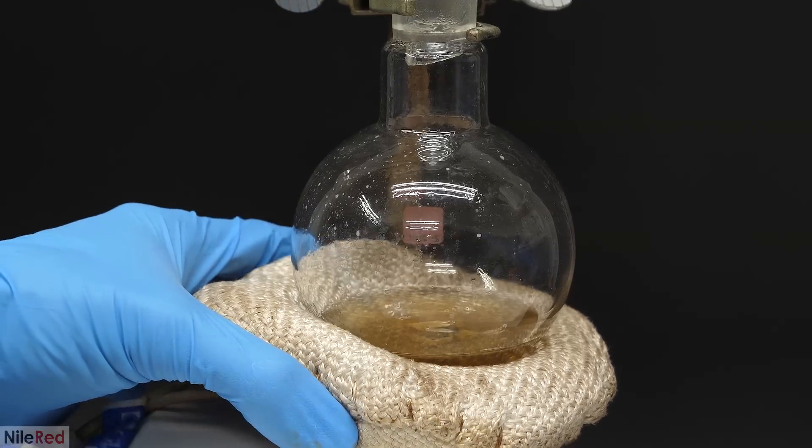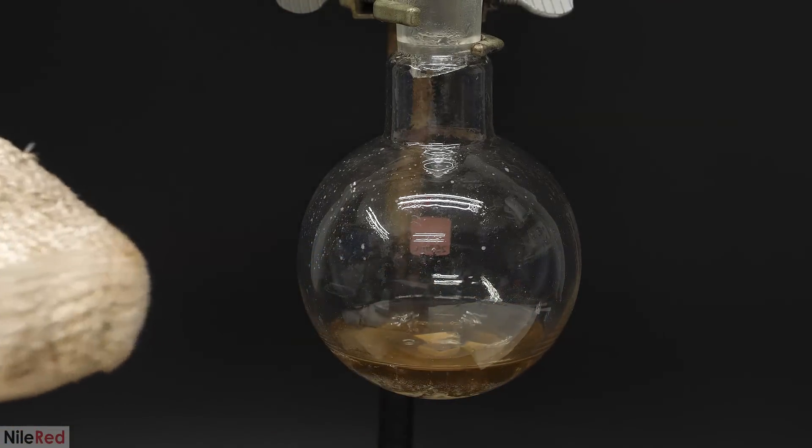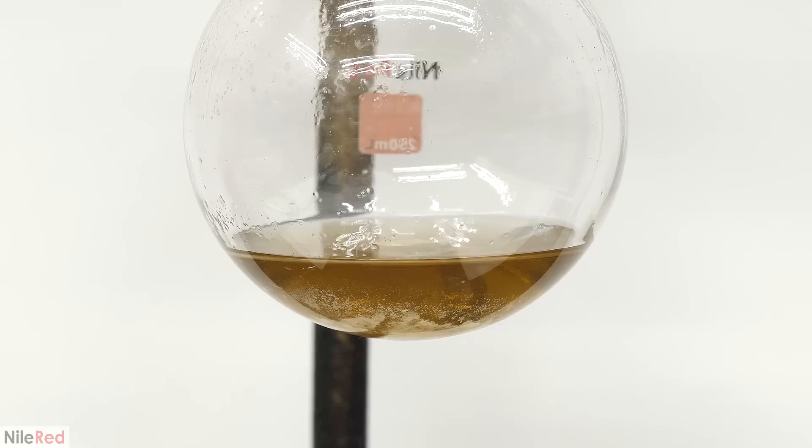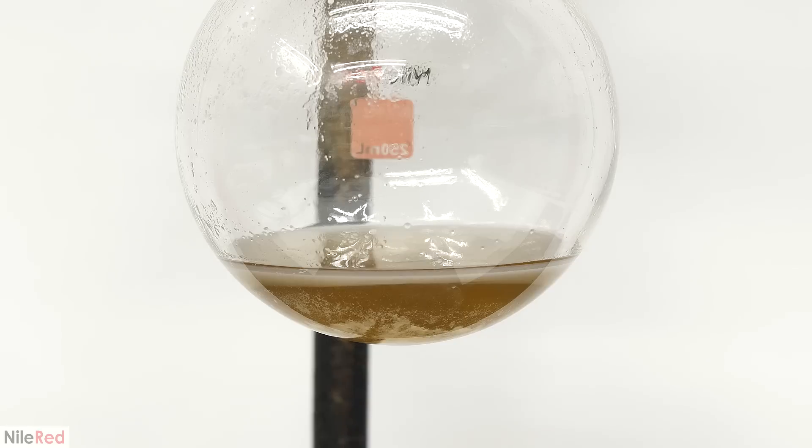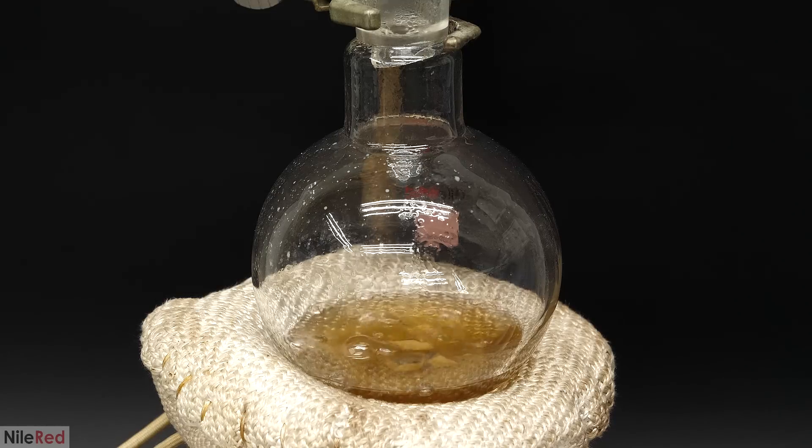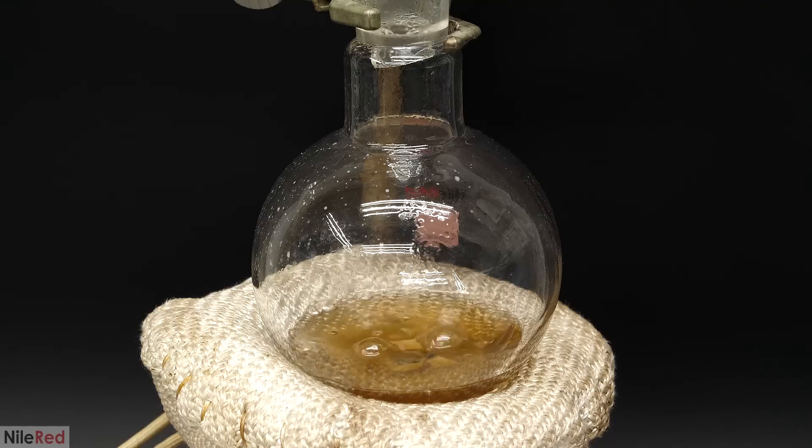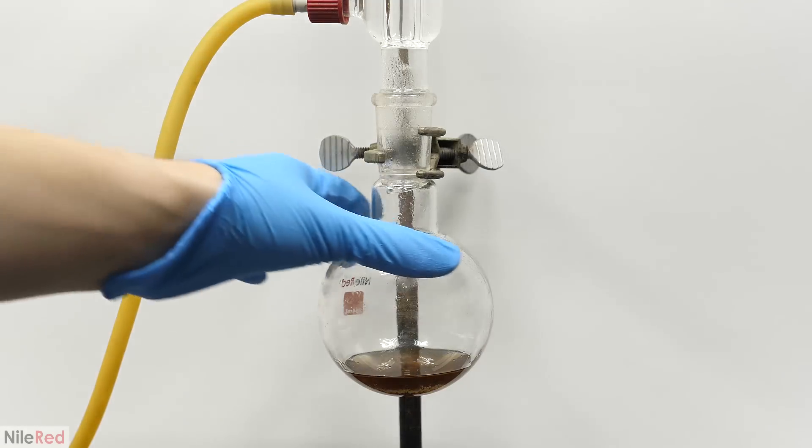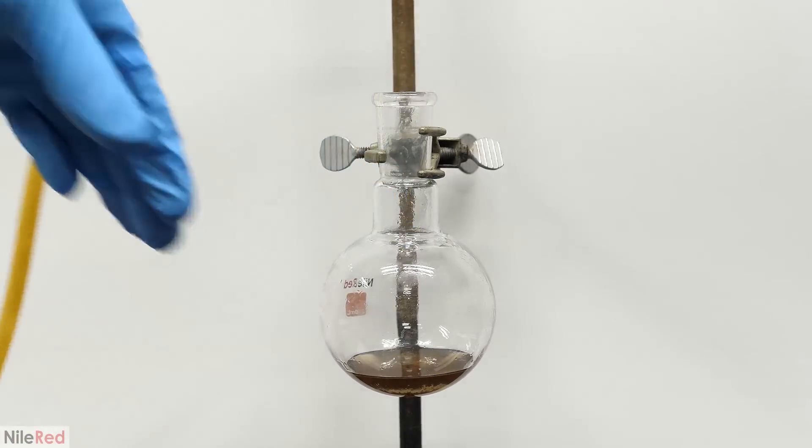After about an hour, I took away the heating mantle to check its progress. As it cooled a bit, it became cloudy, because some of the plastic was separating from the solution. This told me that the polymer chains were still too big, so I boiled it for another hour. This time, it cooled all the way to room temperature, without any cloudiness.